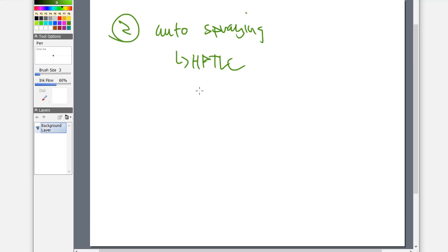There is a drawback, because you just heard me say but, and the drawback here is that not everything can be used. There are certain reagents that this is more appropriate for, and then other derivatizing agents that we would need to make that are not going to be appropriate for these sprayers. They do extremely well with non-viscous material. So if I'm putting something into a solvent like methanol or ethanol, or even acetone, or something that is very volatile that will evaporate off easily, the sprayers work great for those.